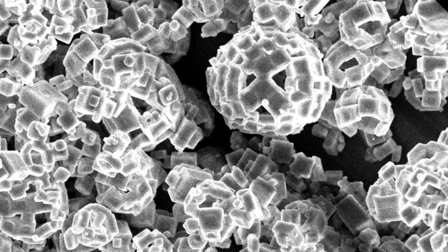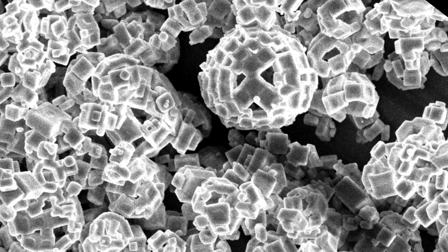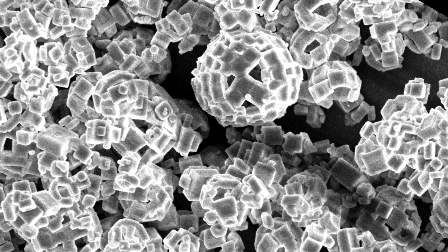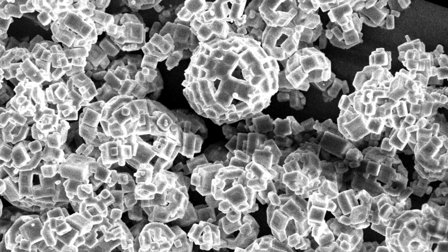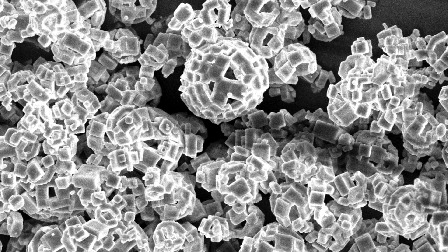This image was taken on a scanning electron microscope, enabling us to look far beyond the ordinary micron-sized world. In it, you can see sort of spherical cages made of cuboid blocks. The incompatibility of the crystalline cuboids with the spheres are ripping the cages apart. There's no chance of making this cubic structure form good spheres.